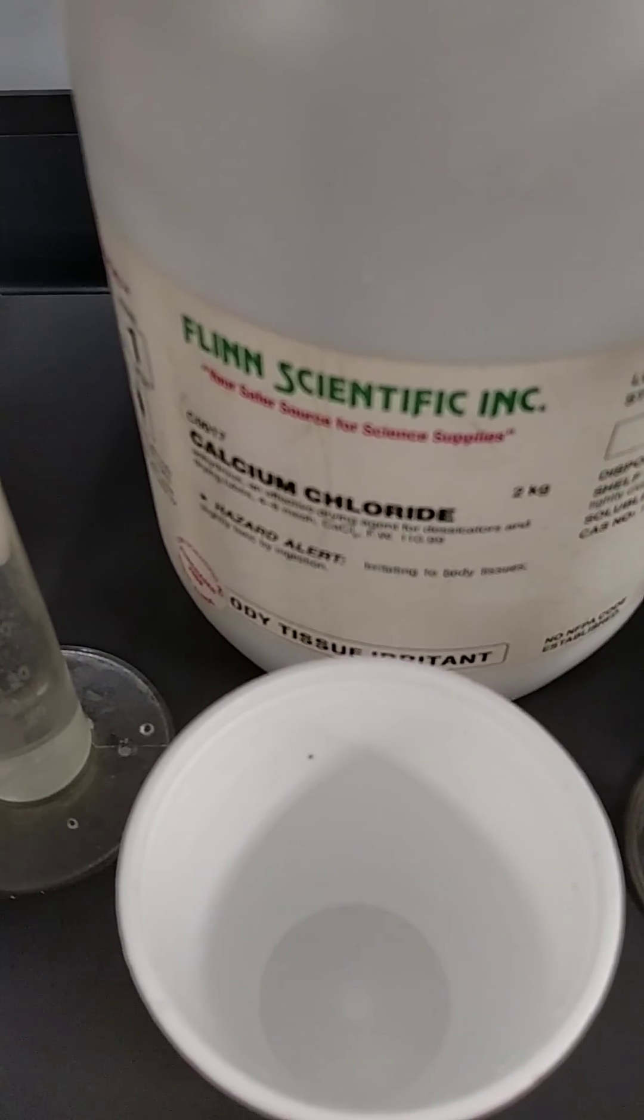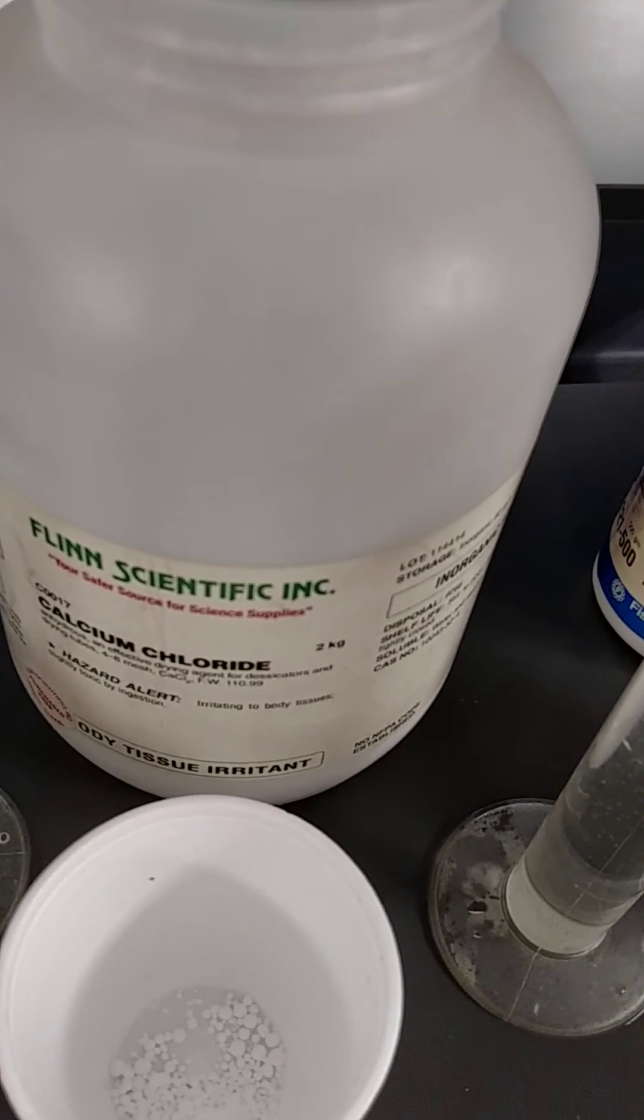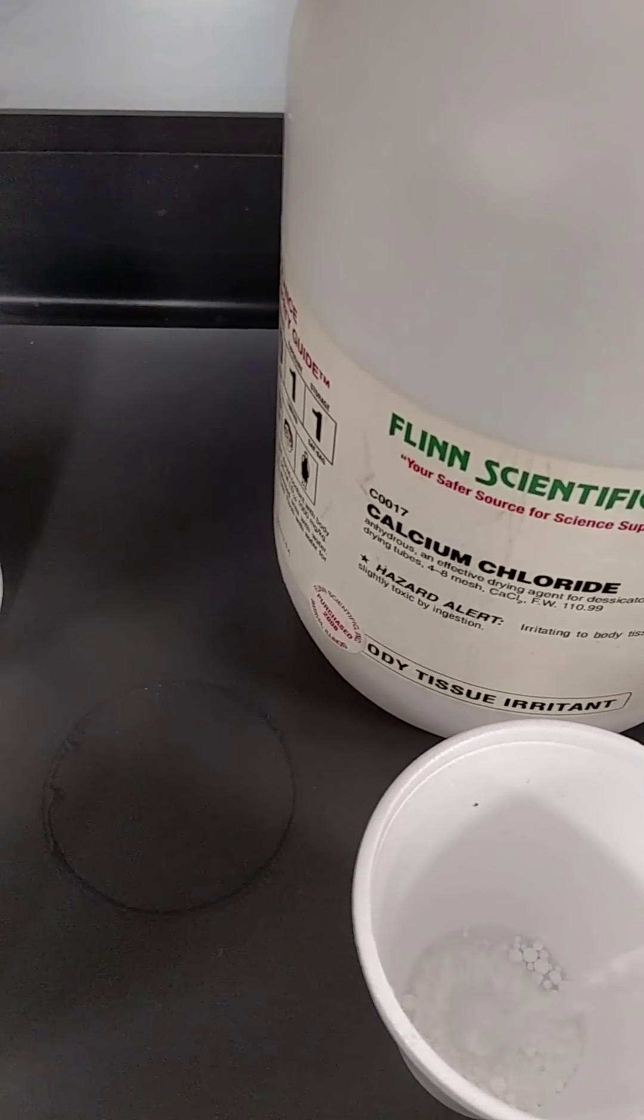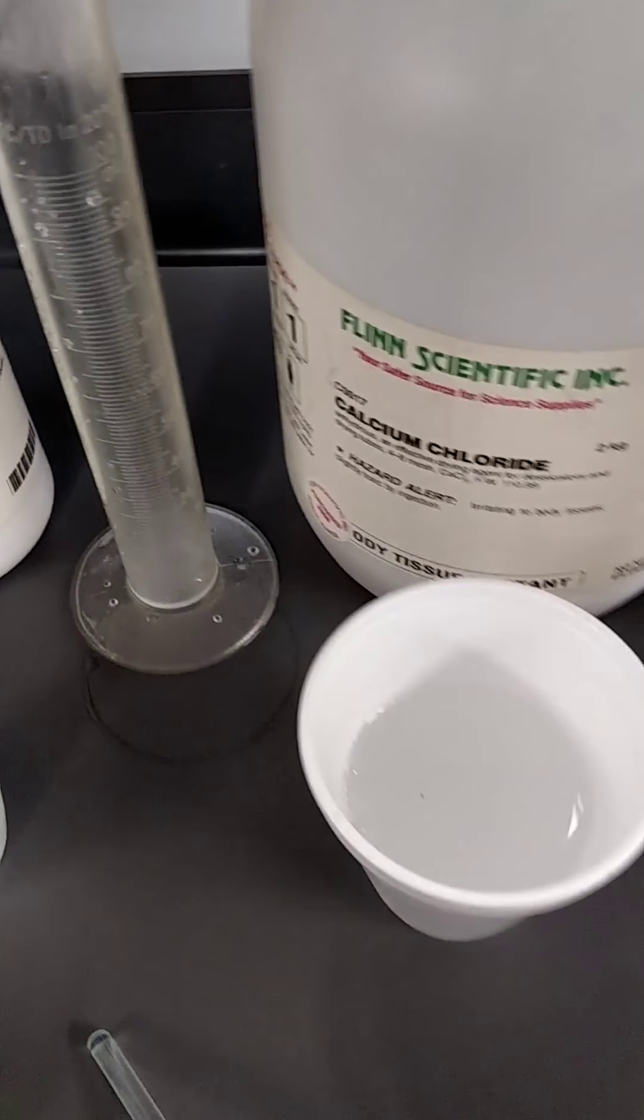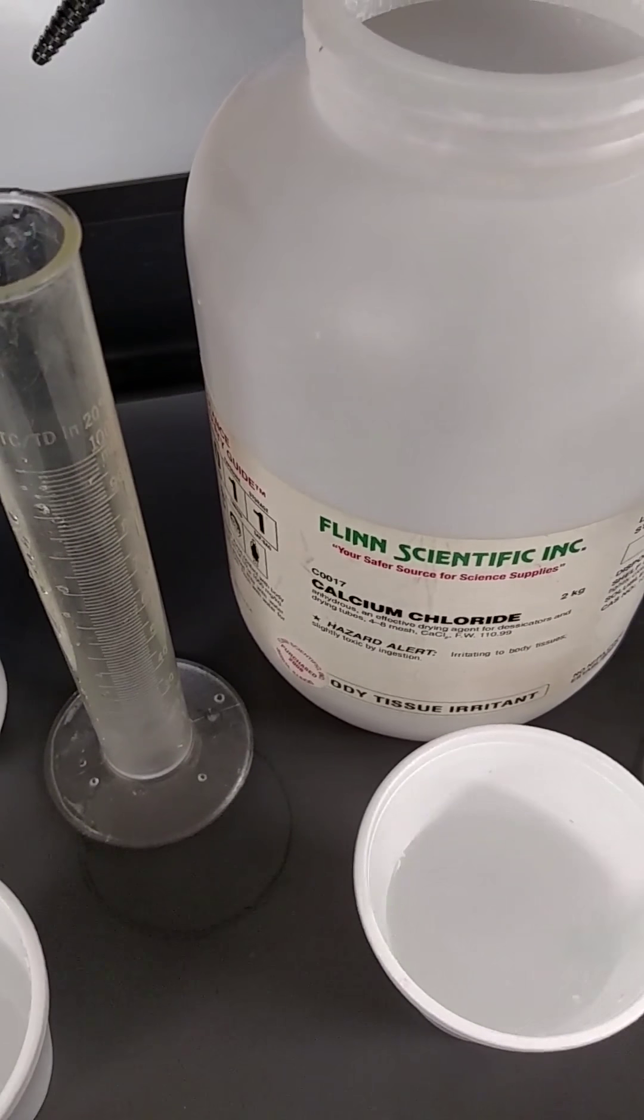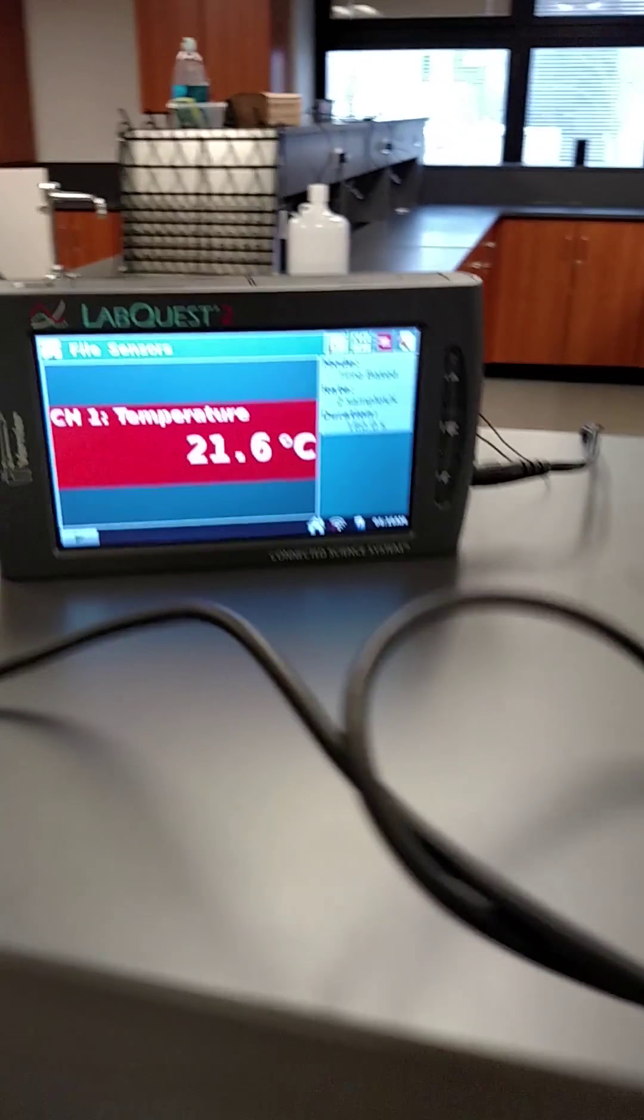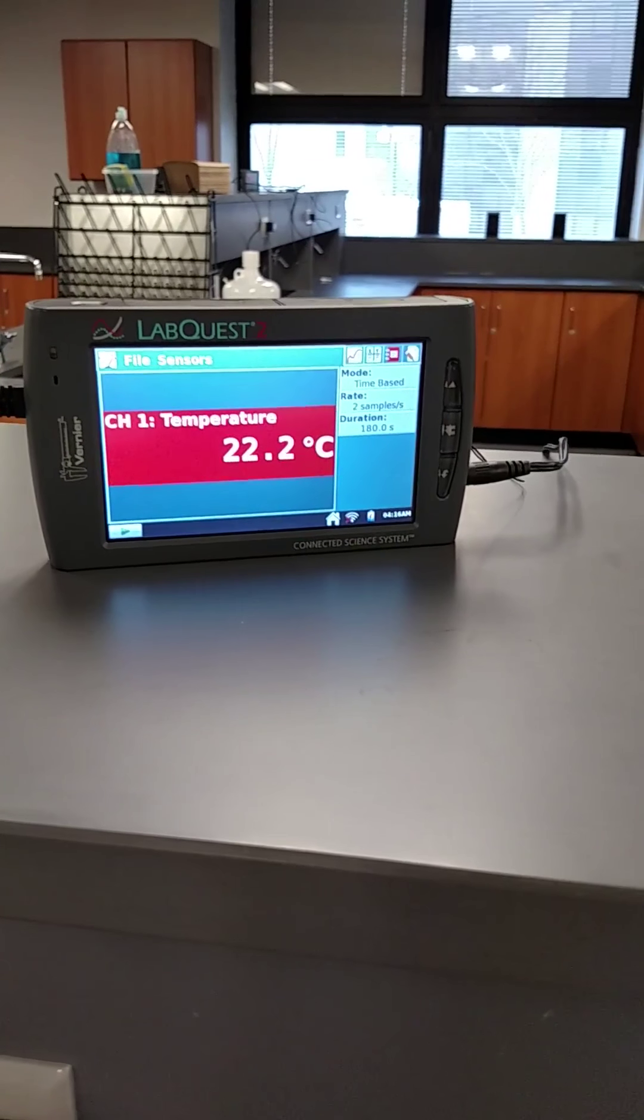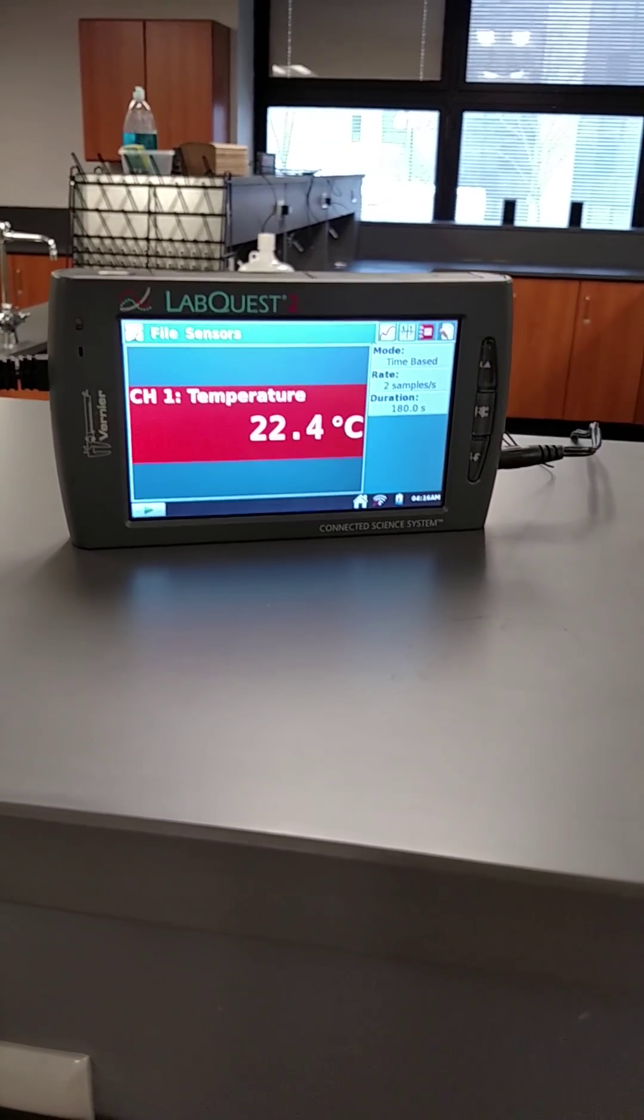Next, calcium chloride. So I just added it. Let's add the temperature probe. Initial temperature, 21.6. And now you can tell this one is going up. So we're going to keep watching it until it stabilizes.